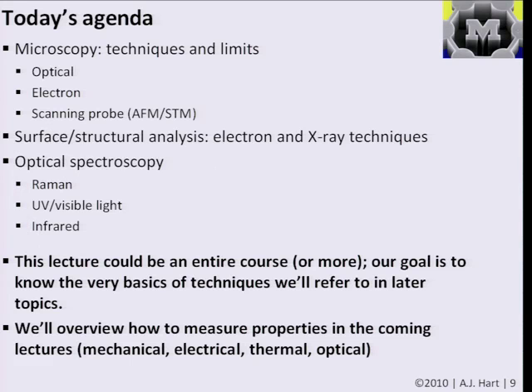And the emphasis here is not to know the details of all the methods, but really to give an overview of the basics of the different methods that are most frequently used to characterize nanostructures, because as we go through the other topics, we're going to be looking at a lot of pictures and spectra using these techniques, and we want to have a working knowledge of what it means.